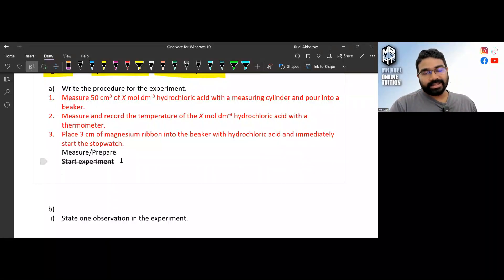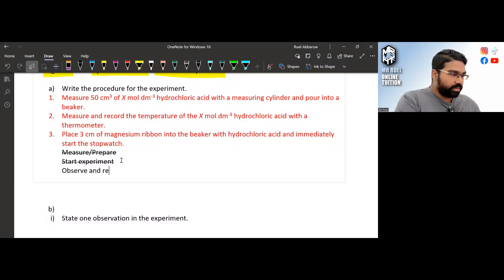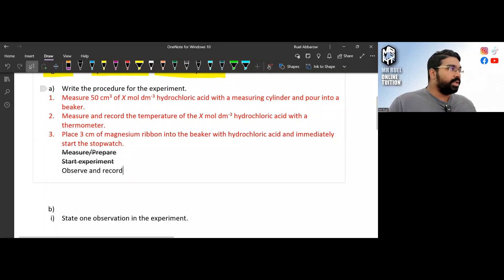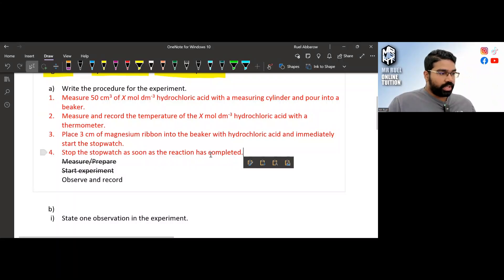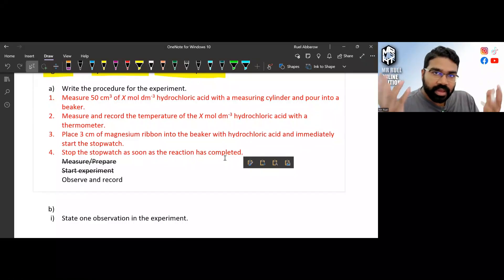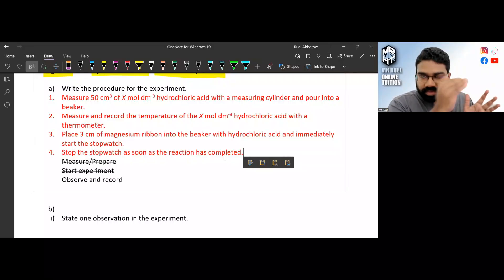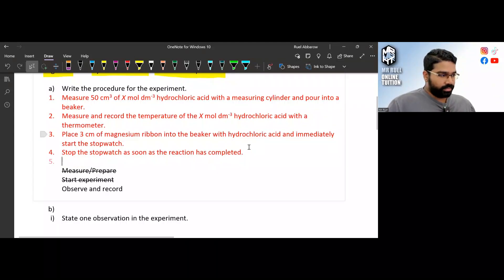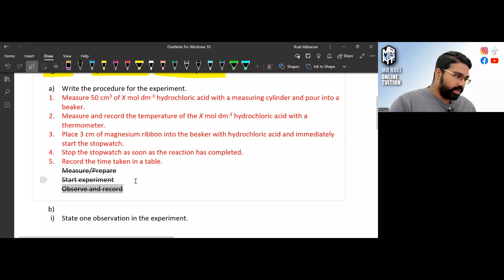After you start the experiment, the next step is to observe and record. Here, we are going to take the time — the time taken for the magnesium to complete the reaction. Stop the stopwatch as soon as the reaction has completed. You must state what you are observing and what you are measuring, then record everything in a table.